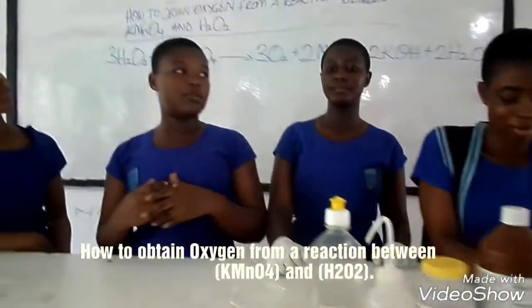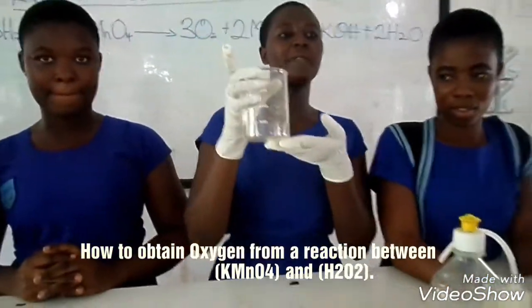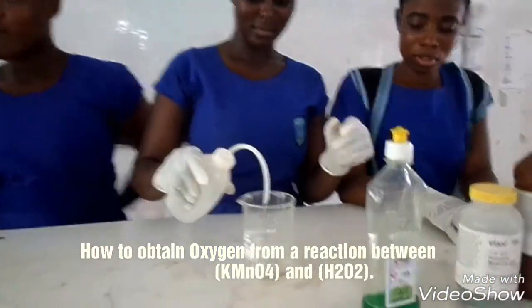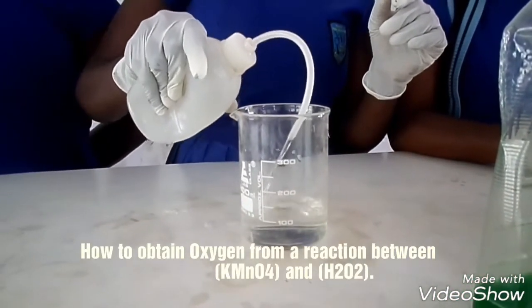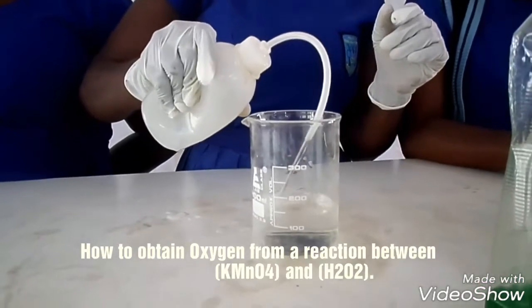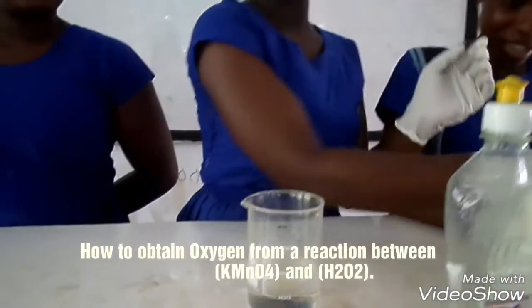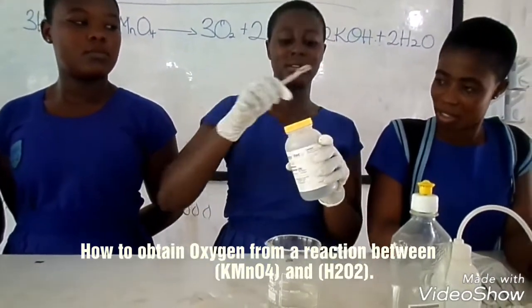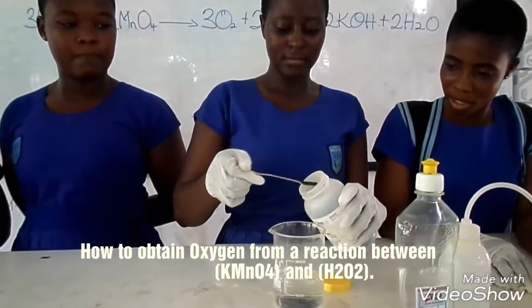So we are going to continue with our experiment. First, you have filled your vessel with water, then you add a spatula full of potassium permanganate.